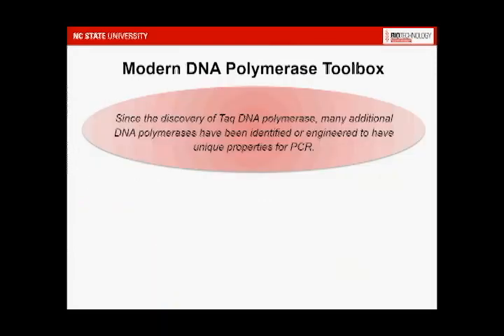Since the discovery of Taq DNA polymerase, many additional DNA polymerases have been identified or engineered to have unique properties for PCR.